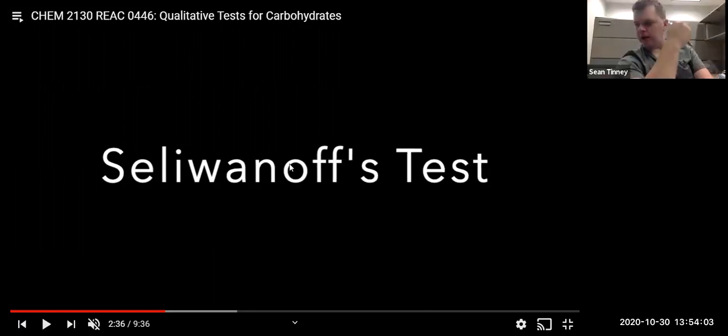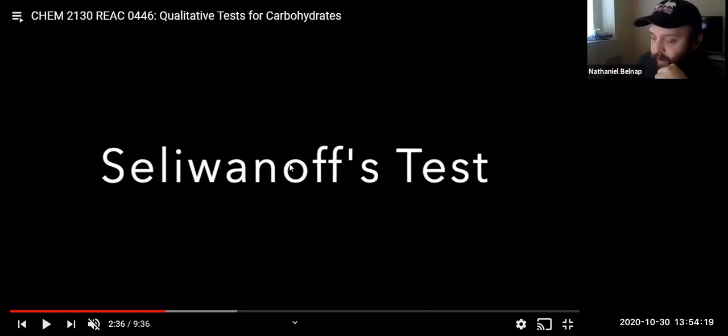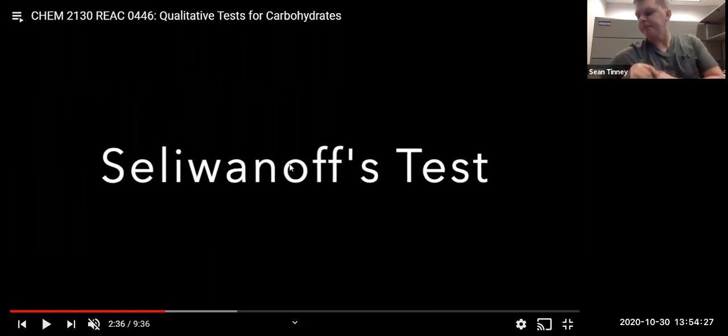So for the final line on that, for the Barfoed's, and they elapsed, what are we putting on that? We don't put the time that it actually went positive or negative, or are we just going to put positive, negative on it? So it's got final, initial, and elapsed. Initial should be negative, final should be positive, and then elapsed time should be 10 minutes. Just want to make sure. Yep, no, you're fine.